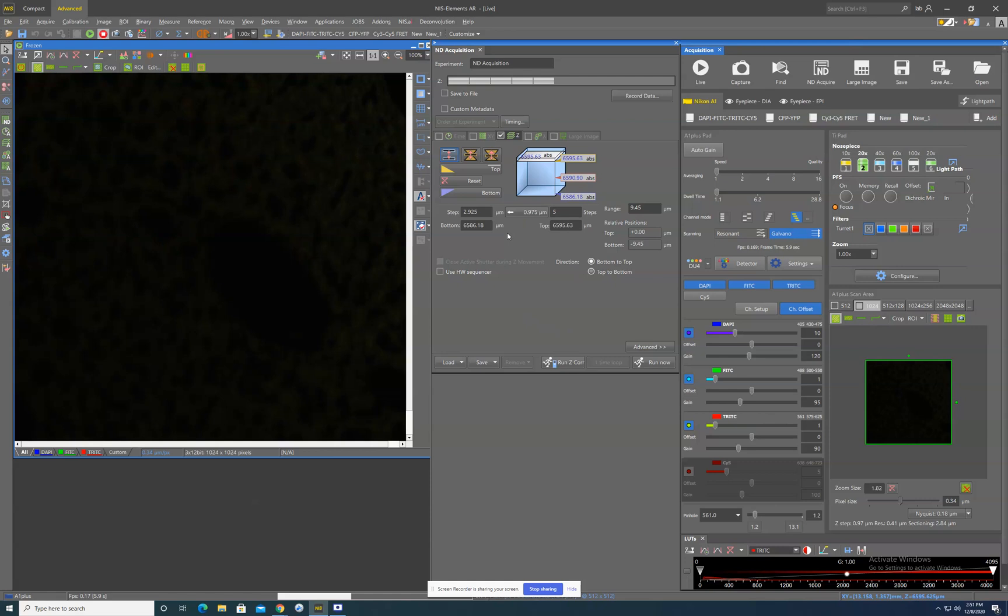In short, on a confocal, every image that you take has a little bit of depth to it. So this calculation will take into account the range that you would like to image and that tiny depth that comes with every image that you take. And it calculates how many images you will have to take and how far apart they will have to be in order for every image to have that sort of optical stacking.